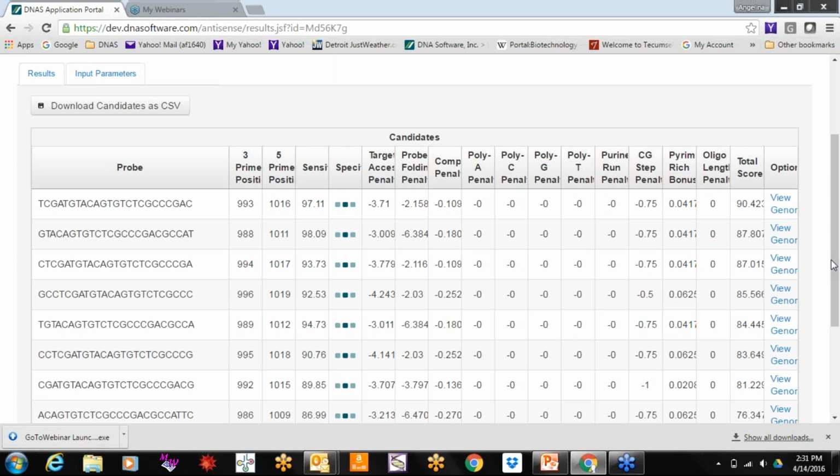Unless you were using the same messenger RNA library, if you were looking to knock down several proteins in the same target, then it could be used in multiplex. But it depends on what your focus is. So yes, if you're focusing on the same messenger RNA library, but if you're going over and above that, then it would be something that we would have to customize for you and build on your platform.